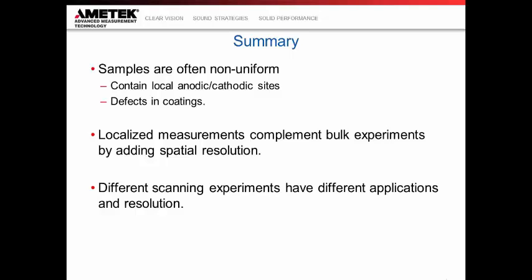So I think all three of these kind of go together to give a picture of what's happening in the corrosion of your system. And different scanning experiments have different applications and different resolutions.